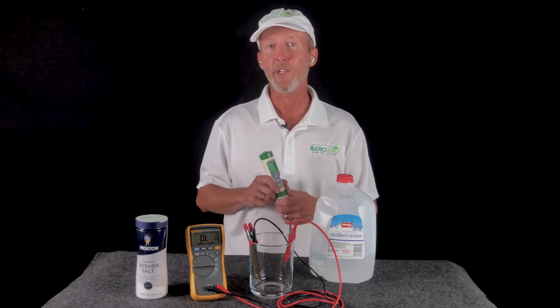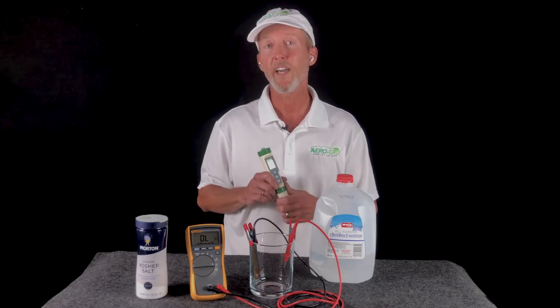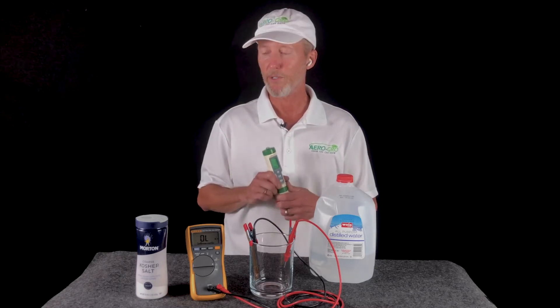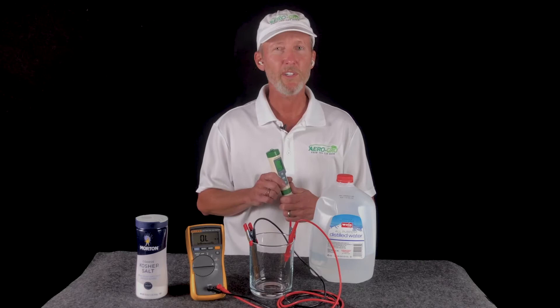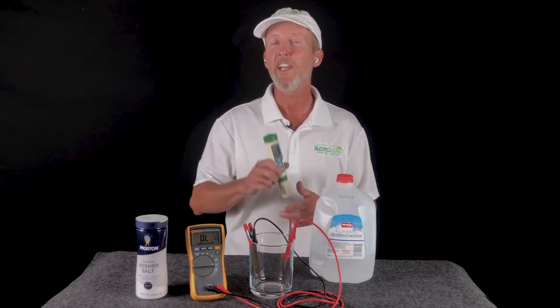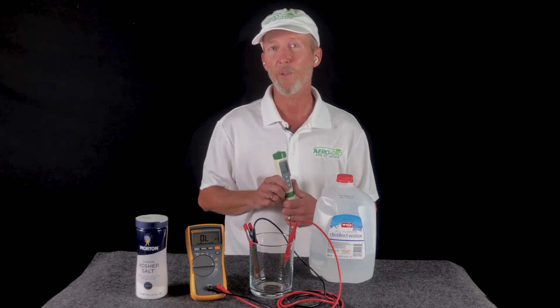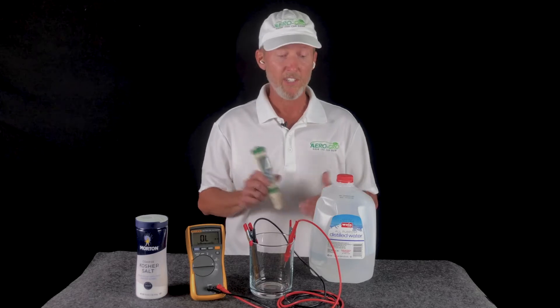What your meter's actually doing at a base level is measuring the resistance of that water. So today what I want to do is a demonstration that's going to go a little bit deeper into two areas. It's going to show you a little bit more about how your meter works and also how water works, which is a great idea when you're working with hydroponics. So let's get started.